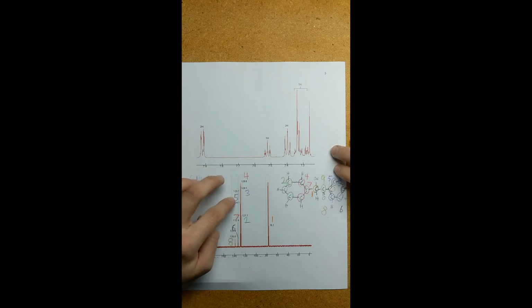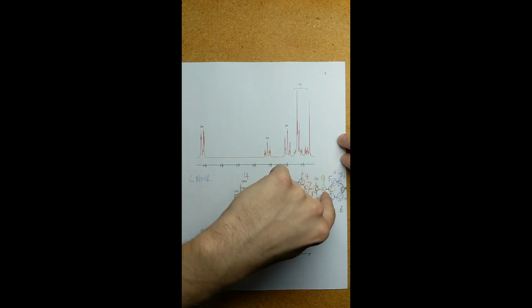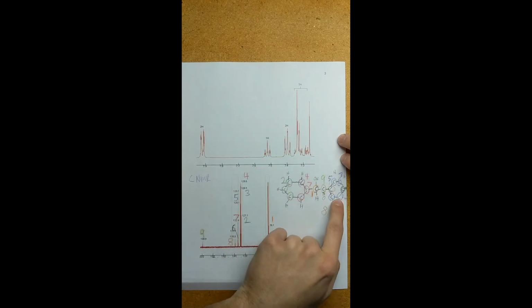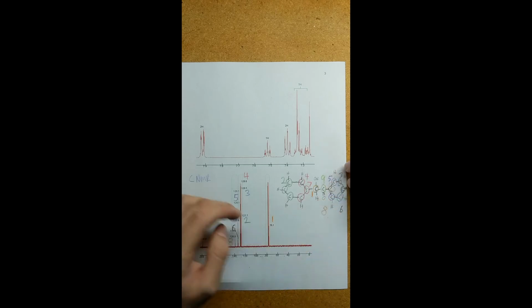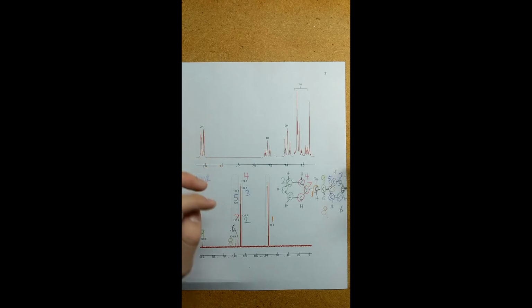Moving on to number 5, slightly more deshielded. At 129.1, we have 2 of those listed here. So again, I grouped these 2 carbons, the inside carbons closest to this double bonded oxygen on this ring structure, because as you can see they are quite close to that, and it would make sense as to why they would be more deshielded than these 2, for example.